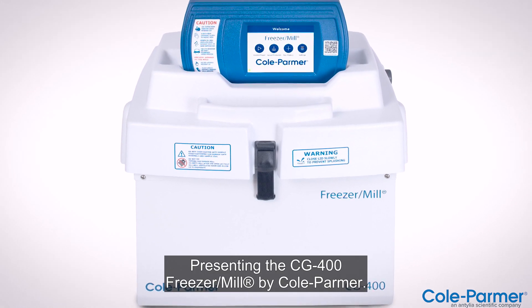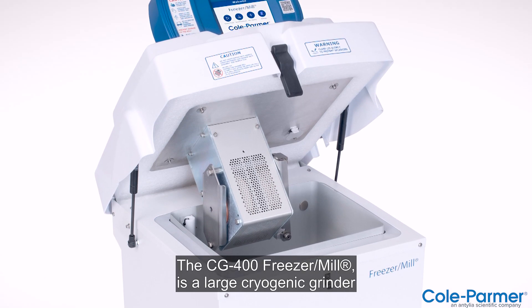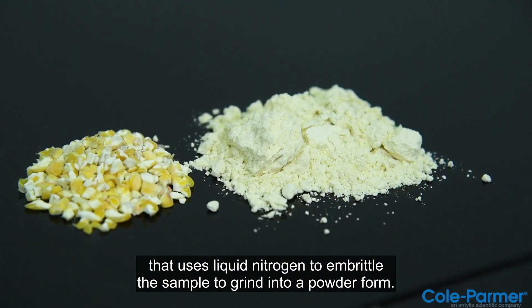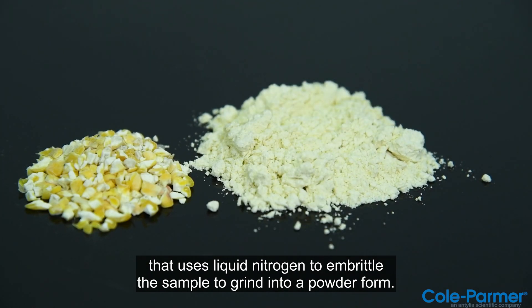Presenting the CG400 Freezer Mill by Cole Parmer. The CG400 Freezer Mill is a large cryogenic grinder that uses liquid nitrogen to embrittle the sample and grind it into a powder form.